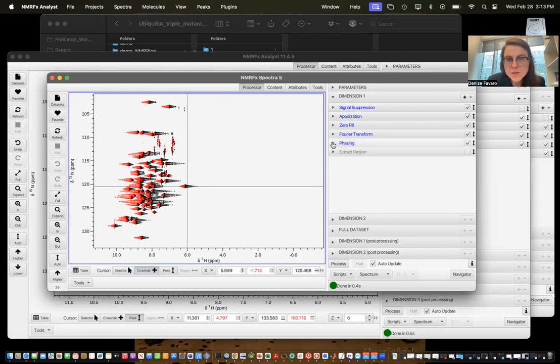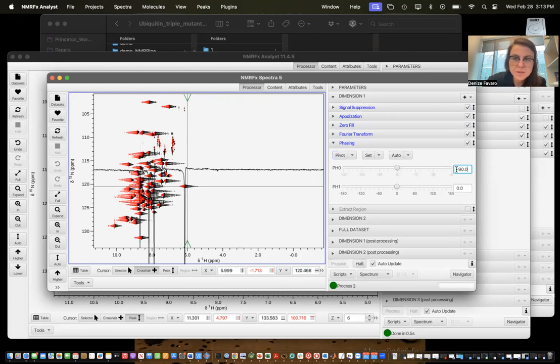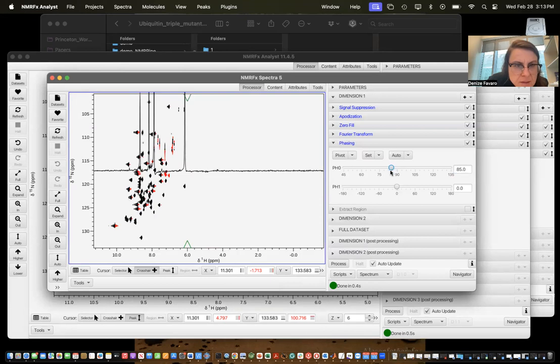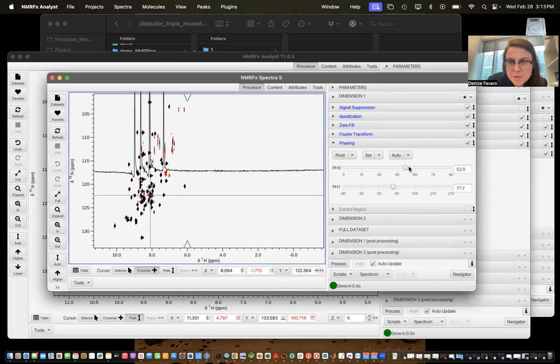Let me just do my phasing at my crosshair, and then I think it's minus 90 or 90, actually 90, close to, a little bit less than that. So we can do a little bit here just to correct more. Yeah, so we can do a little bit of one. We're not so worried about this guy here because it's the side chain, but we're more interested in these guys here.